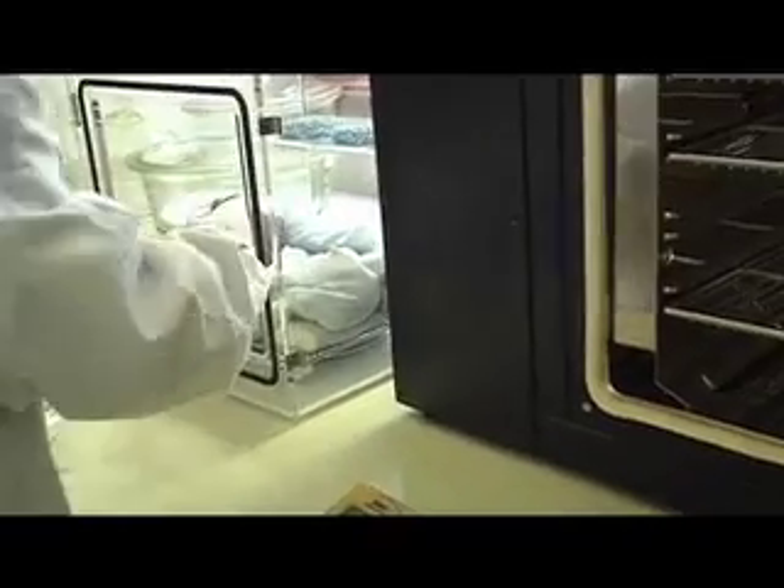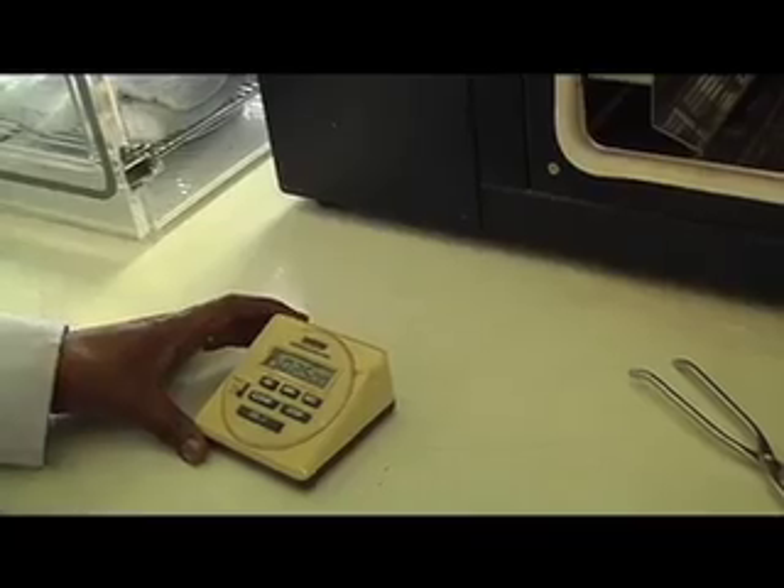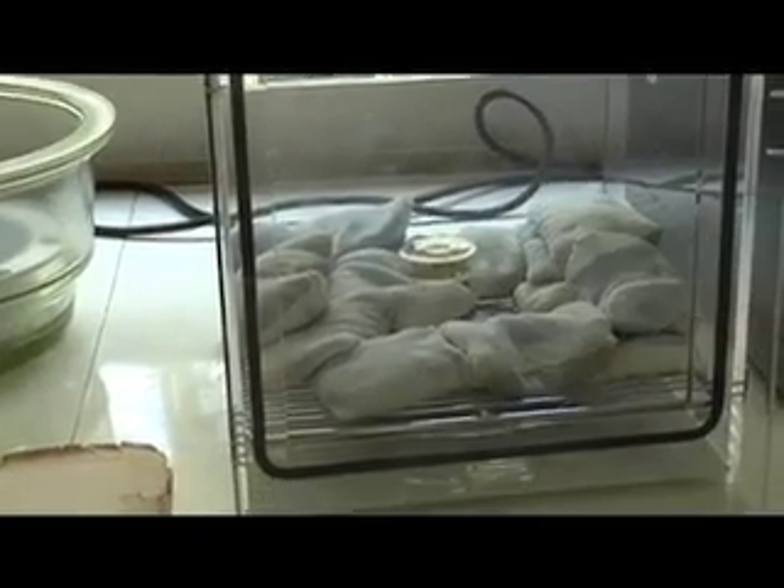After drying, they are taken out and allowed to cool in a desiccator to avoid changes in moisture. After cooling, the dishes are reweighed and the moisture content is calculated on a wet weight basis.